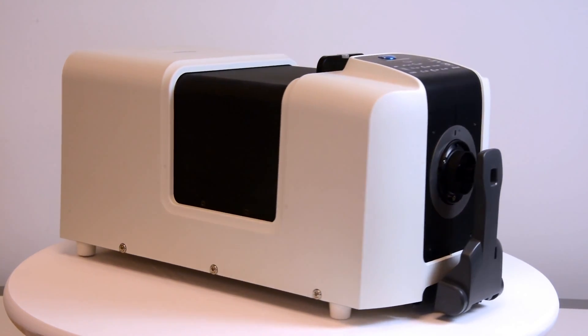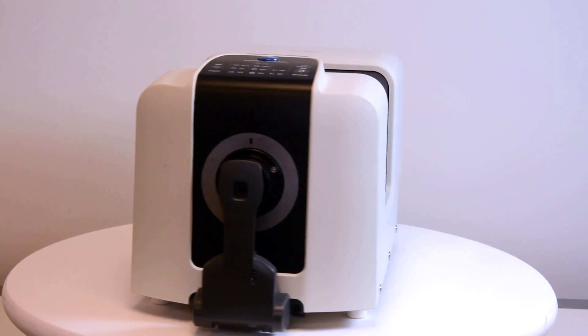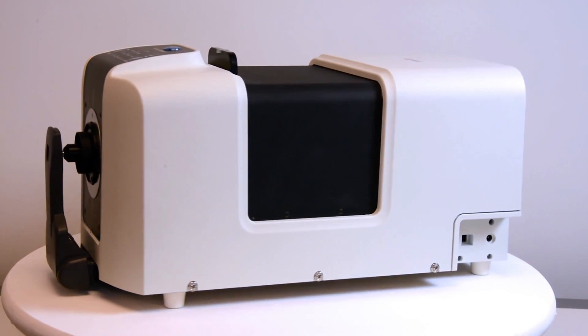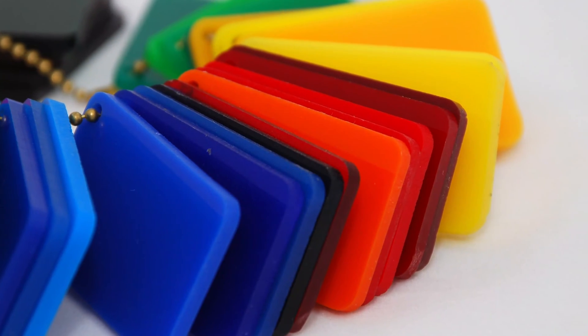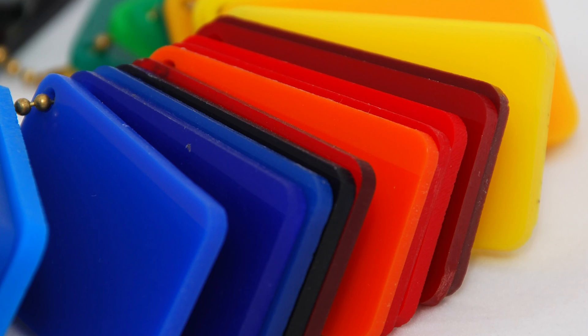Introducing the industry's first color and gloss benchtop spectrophotometer, the CM36DG from Konica Minolta Sensing. The CM36DG has an integrated ISO 2813 compliant 60-degree gloss sensor inside to simultaneously measure color and true gloss.